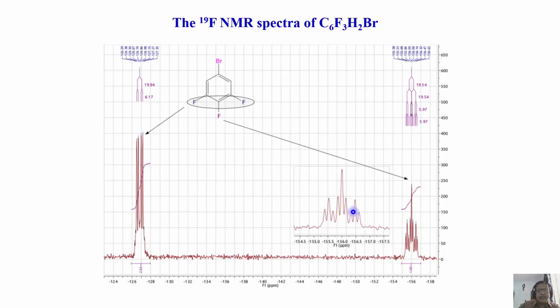So you extend this. If I look at a molecule like this, you have 2 fluorines and 1 fluorine here. And if I look at this fluorine, what is going to happen? It is coupled to 2 fluorines almost equally because of the perfect symmetry. They are chemically equivalent. Coupling is also the same. Then instead of a doublet of doublets, the central lines of the 2 doublets overlap. It looks more like a triplet. Interesting, right? It looks more like a triplet.